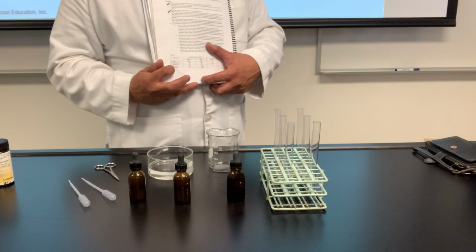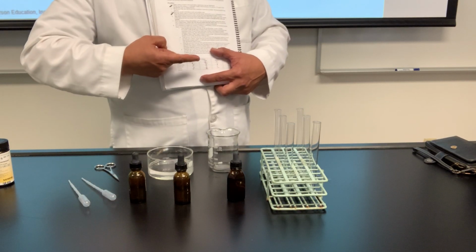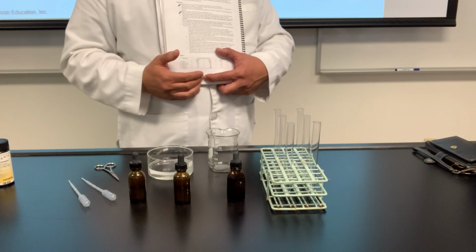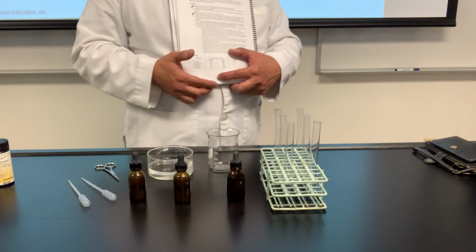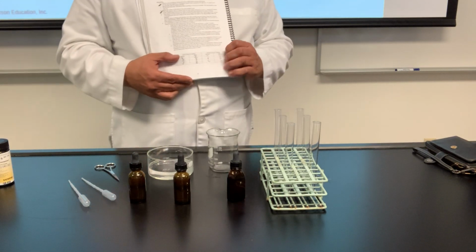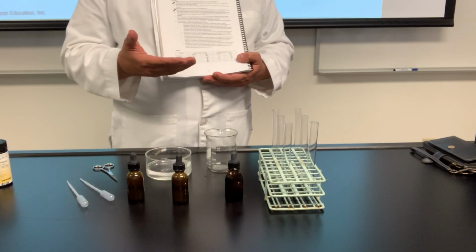Albumin is a protein, the other macromolecule. Will it go through? No. The macromolecules do not go through because they're too big, unless you're a cell. So, watch this. We're about to confirm this is happening here.